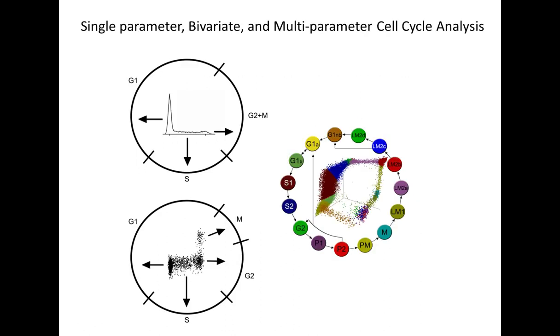The term cell cycle analysis has come to define cytometric assays to count cells in cell cycle phases, compartments, or states. I'll use these words throughout the talk interchangeably.